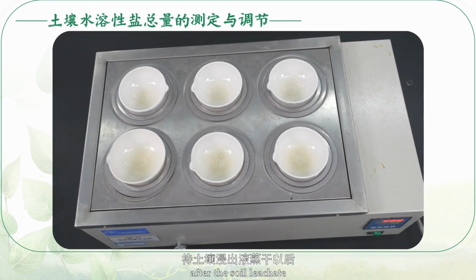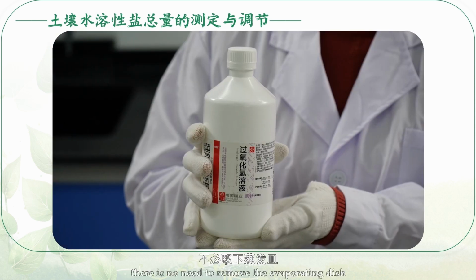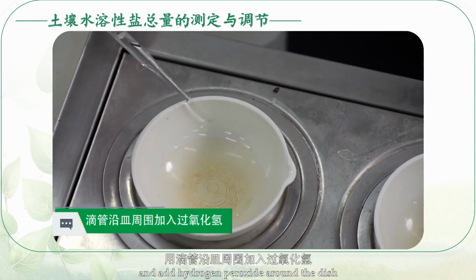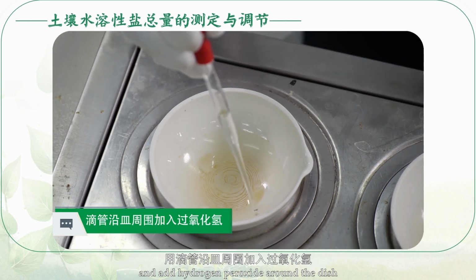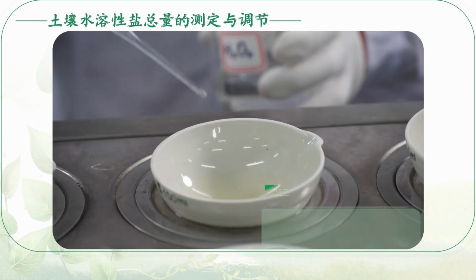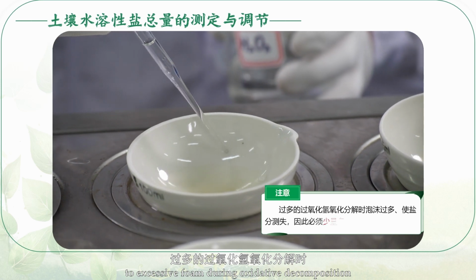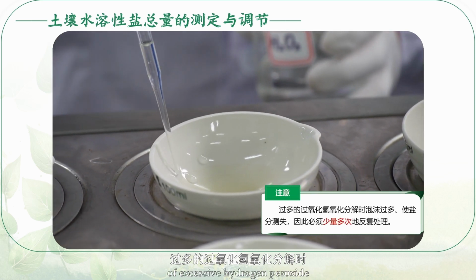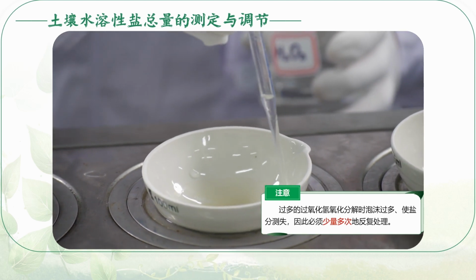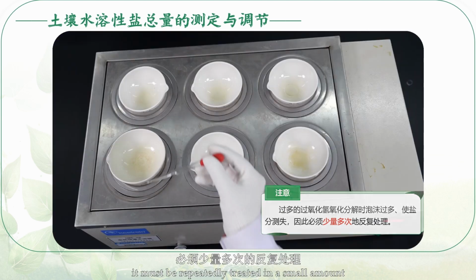4. After the soil leachate is evaporated to dryness, there is no need to remove the evaporating dish. Add hydrogen peroxide around the dish with a dropper to moisten the residue. Pay attention to excessive foam during oxidative decomposition of excessive hydrogen peroxide, which will cause salt loss. So, it must be repeatedly treated in small amounts.